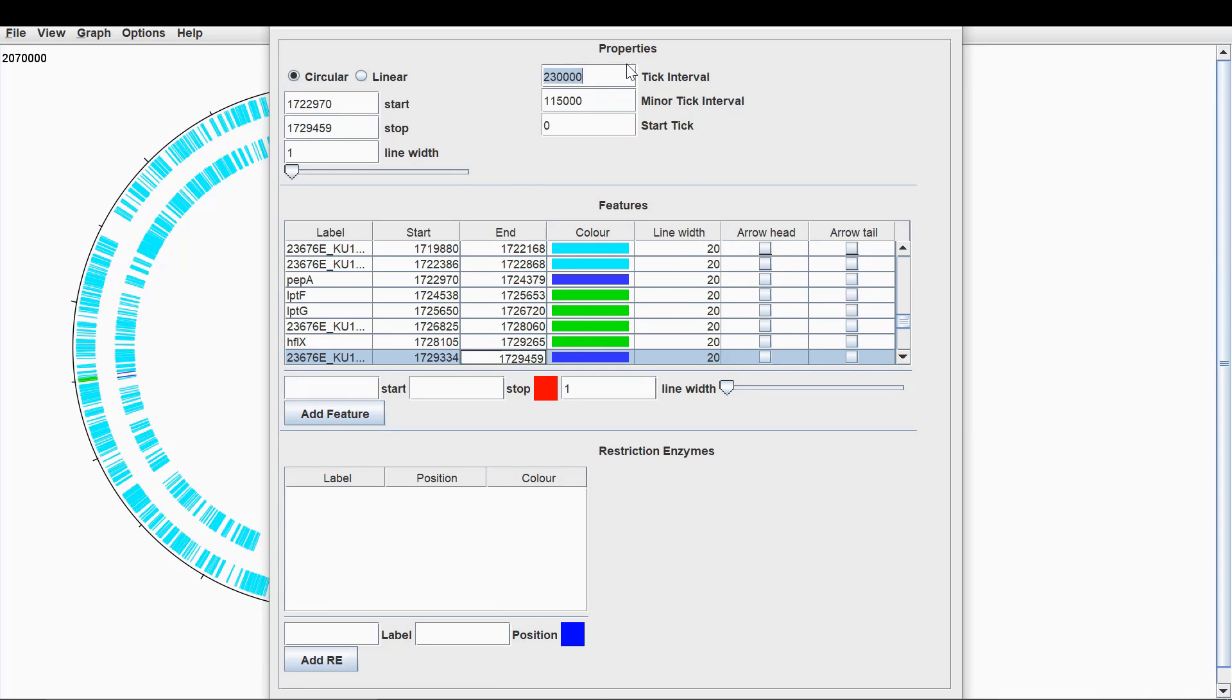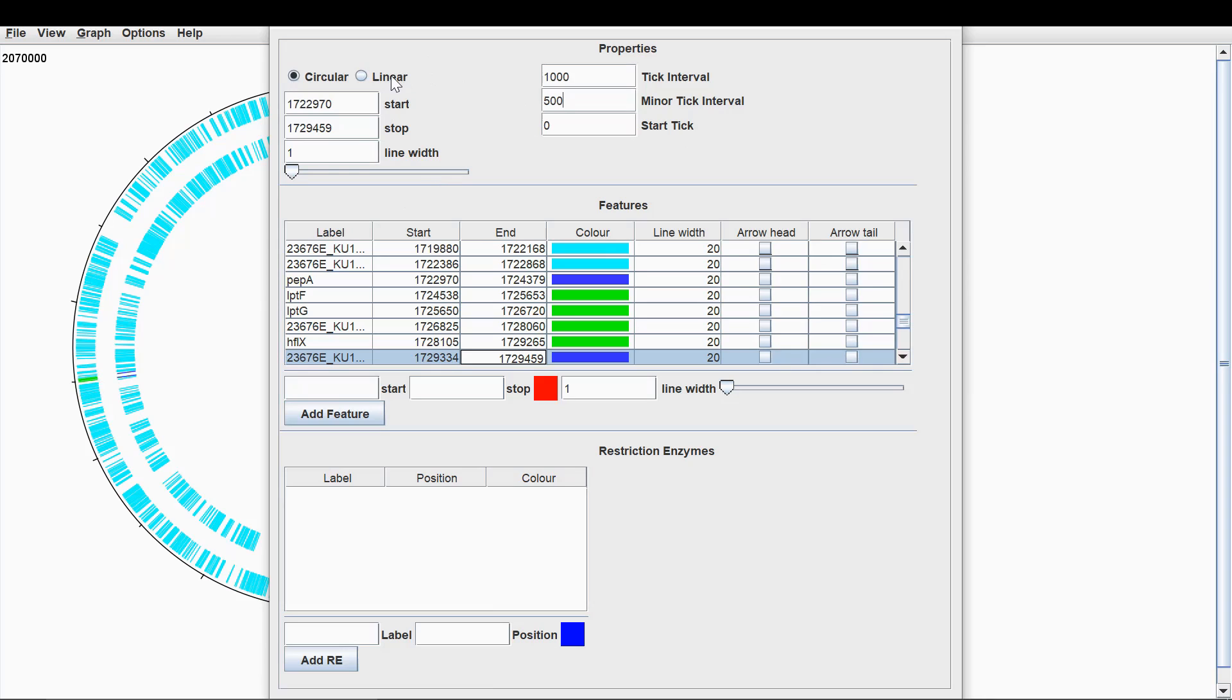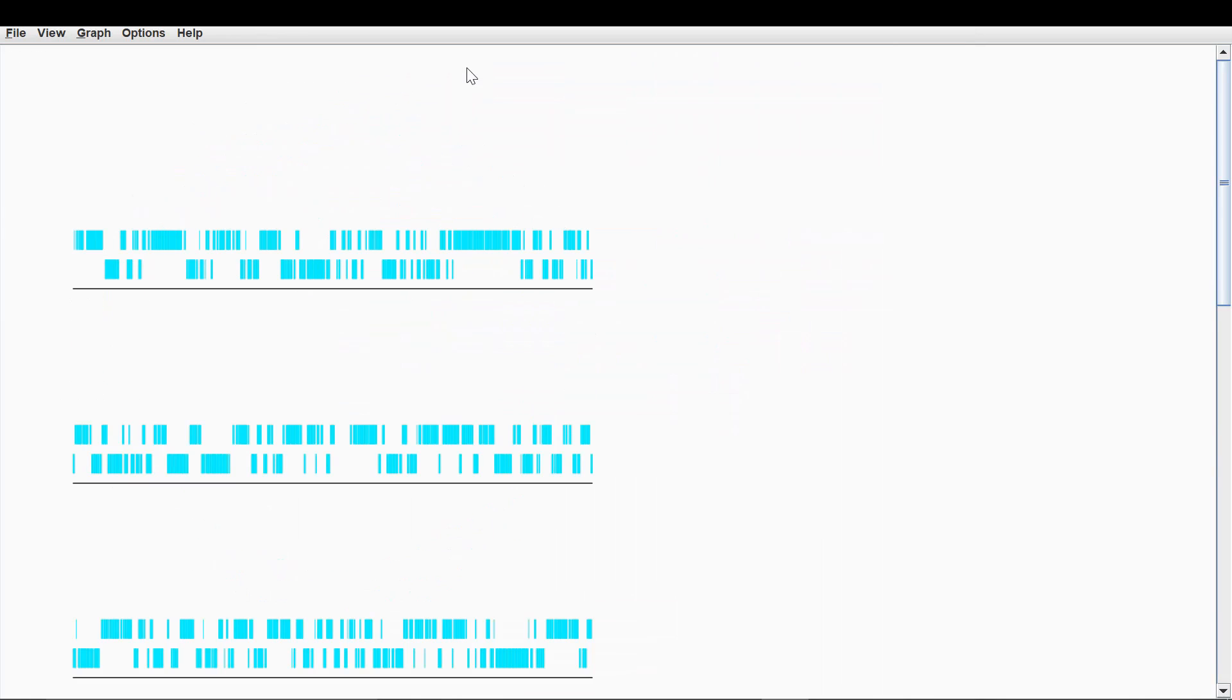For the tick interval, you'll want to change this. So the tick intervals are these marks around the side of the circle here. So we're going to change the tick interval just because we're looking at a much smaller region. So I'm going to change that to 1000. And for the minor tick interval, so that's the ticks in between these larger intervals, I'm going to change to 500. At this point as well, we want to look at a linear portion because this is linear, not circular. So change that to linear and then you press enter.